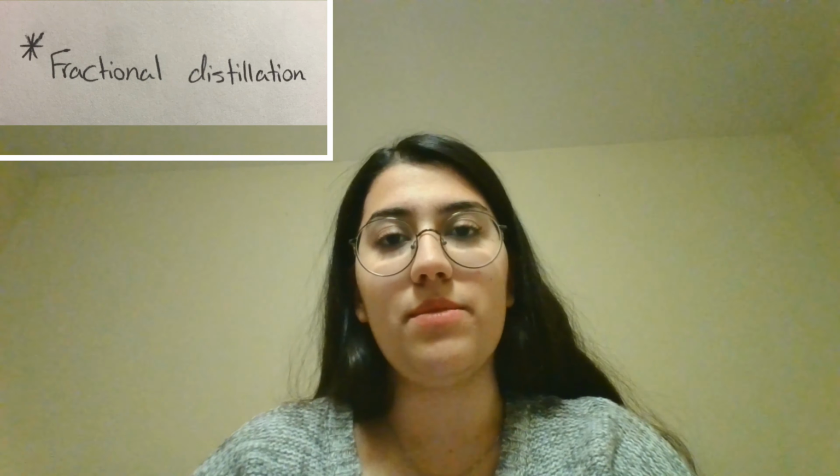The fourth technique I would like to talk about is distillation. It is a useful method for purifying a liquid and extracting it from a solution. It has two different methods to use. One is simple distillation and one is fractional distillation. Simple distillation is used for components with boiling points differing by more than 100 degrees Celsius, and fractional distillation is used for components with boiling points differing by less than 100 degrees Celsius. In this course, we weren't required to use any fractional distillation method.